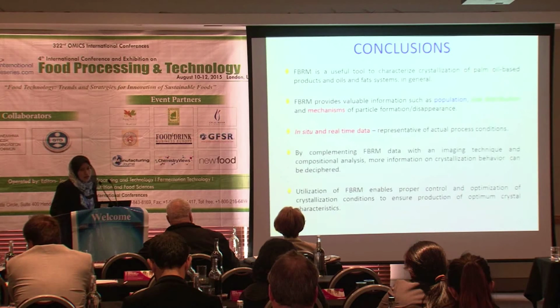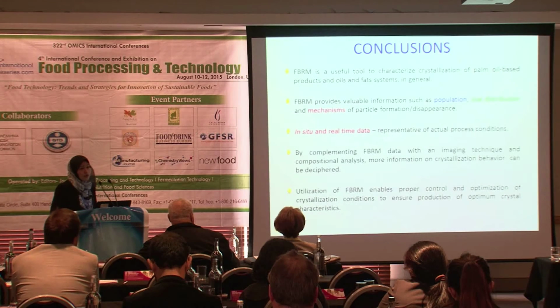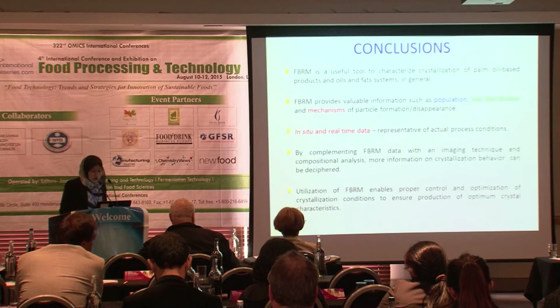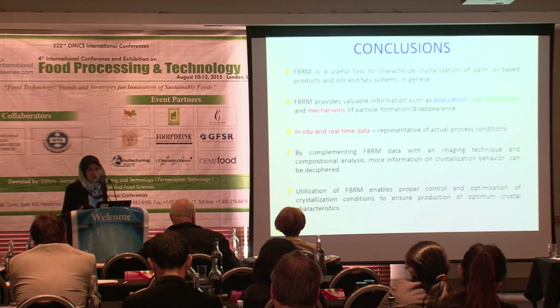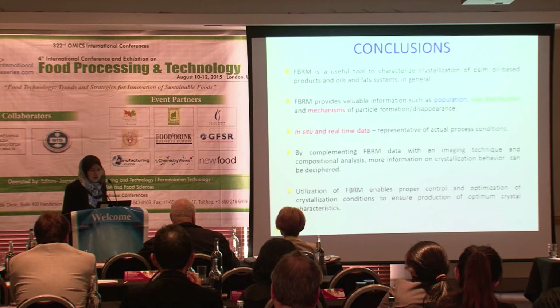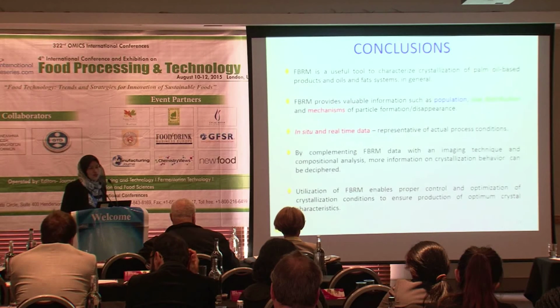And if we complement the FBRM data with microscopical images, or maybe more sophisticated particle video microscopy, which is a very expensive microscope in which you put the vessel, I believe we can get more information on the actual conditions within the vessel. And lastly, the use of FBRM enables proper control of the operating conditions during a crystallization process, and this also ensures that we produce the optimal crystal characteristics for usage in a variety of food industries.